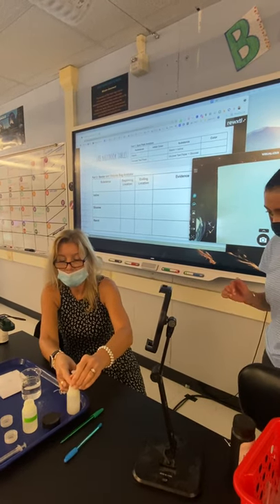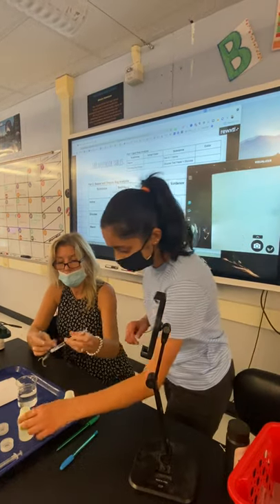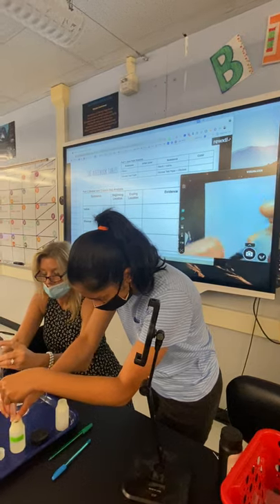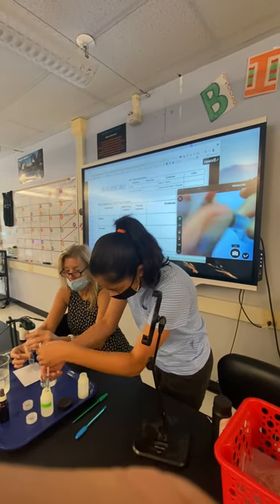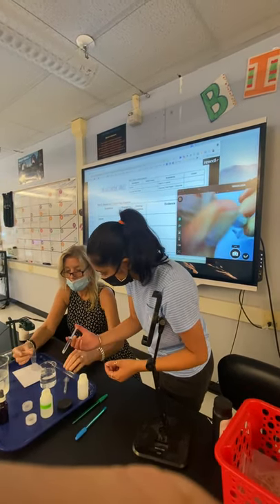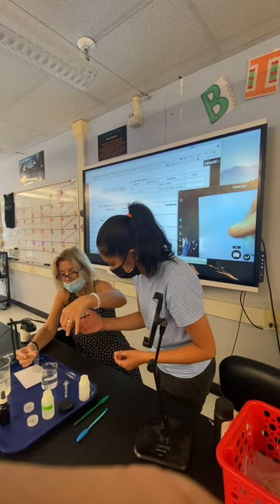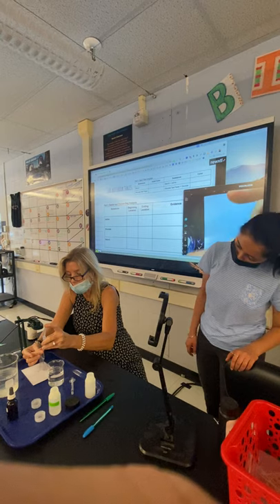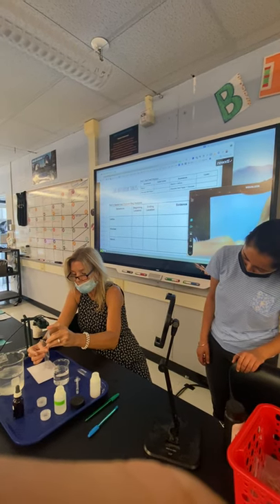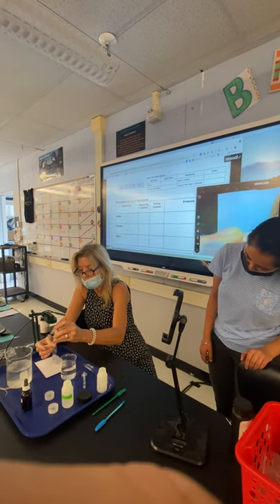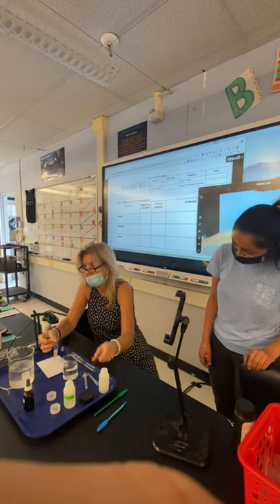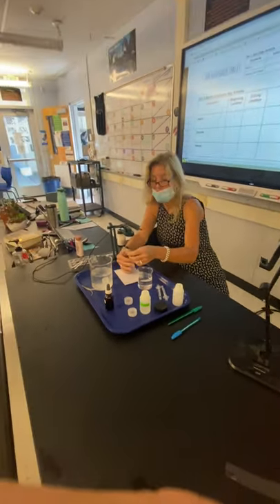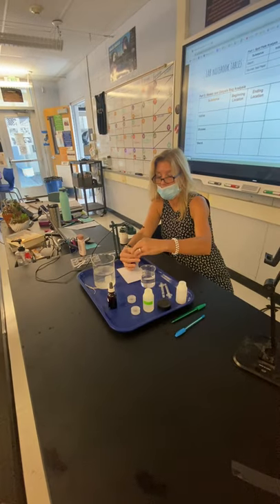Can you suck up some glucose for me? Use that syringe in there. Here's the starch — slipping it in the end here, putting the starch in there. Now I'm going to add the glucose. We know glucose is starting off in here because we just put it in here. And then I'm going to tie off the other end.